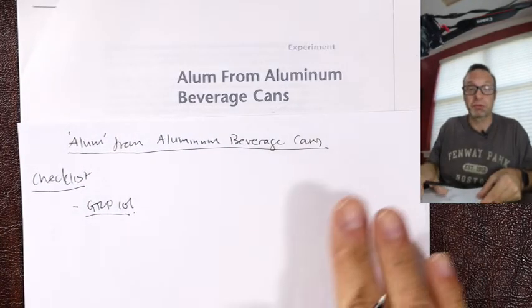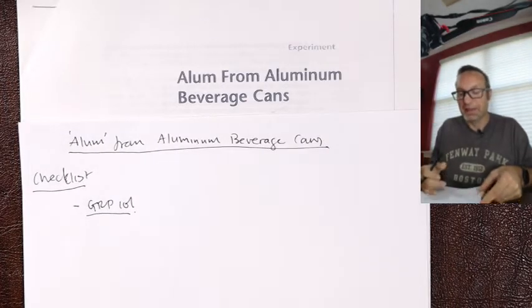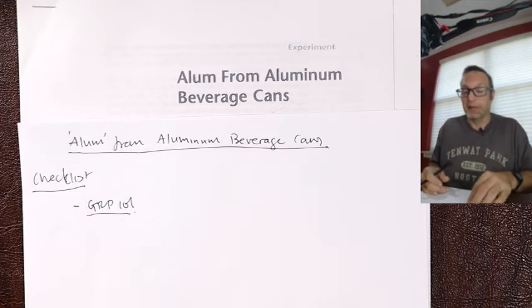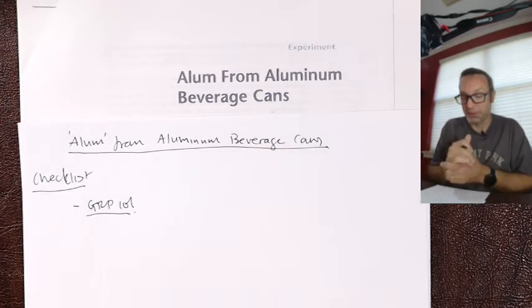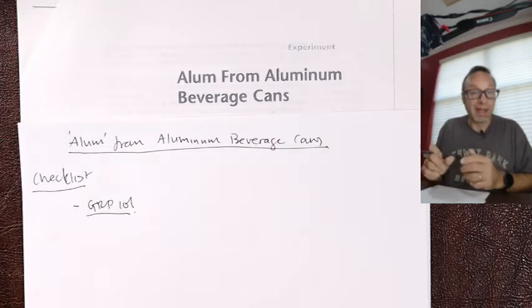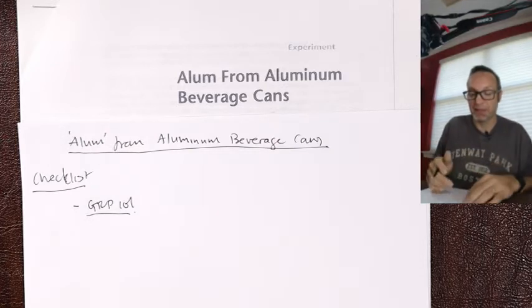You'll find instructions, some pictures of what you see during your experiment which I'll draw and hopefully superimpose those pictures on top, and obviously some data. What I'm going to do is work through my regular semester pre-lab, give you all the background, and give you a couple of hints on the math.